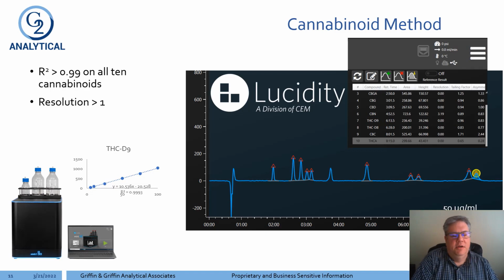So as you probably already know from Alicia's talk, the mini LC is a miniaturized HPLC that is relatively compact, and you can see a picture of it there along with the laptop that comes along with it for data acquisition. It does have 2 pumps.